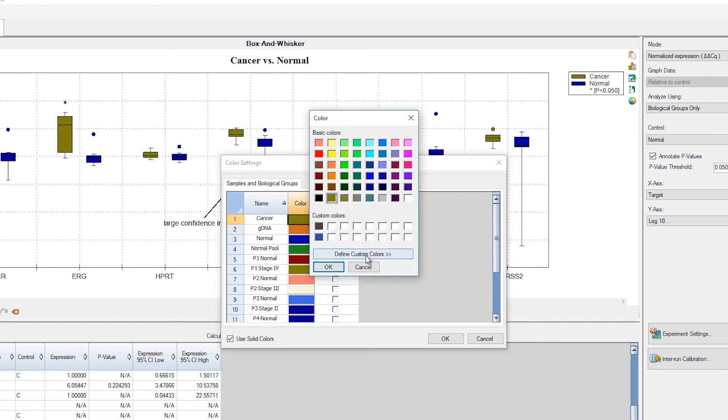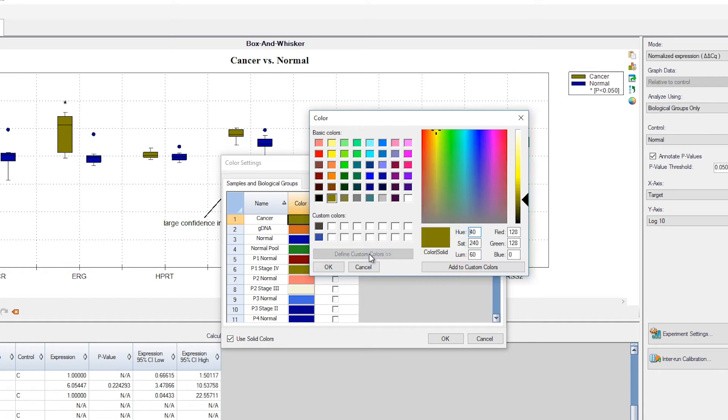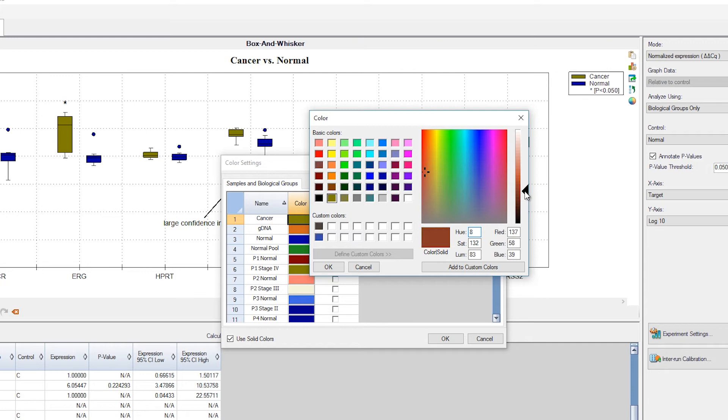In that case, we'll define a custom color. Here we can enter RGB values or pick a color on the spectrum. Let's go with a nice brick color.